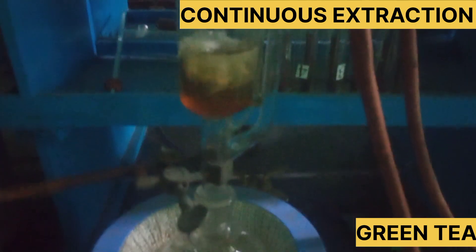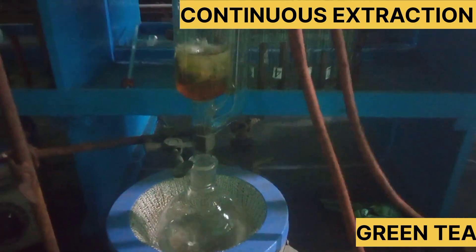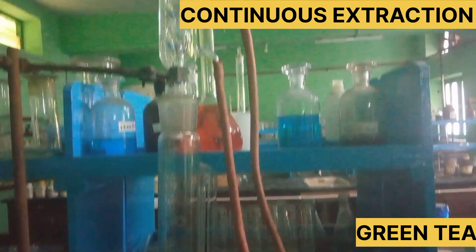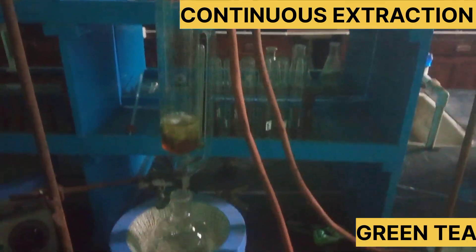Here we have a green tea packet. The green tea packet is used to extract the vegetable matter.